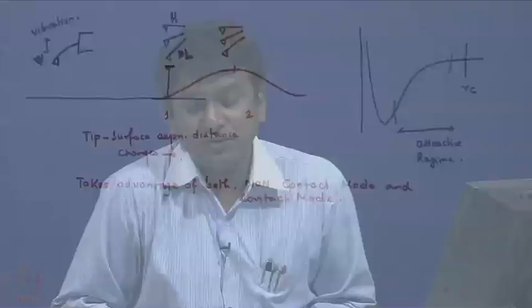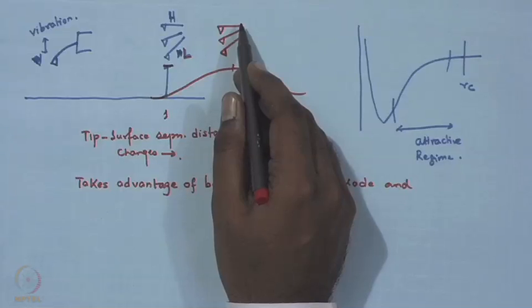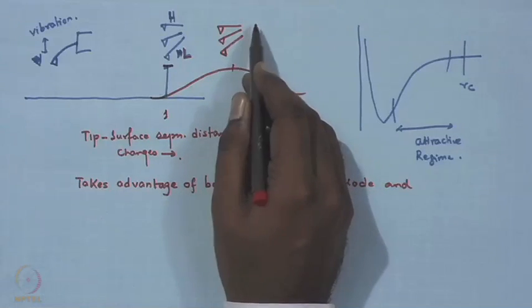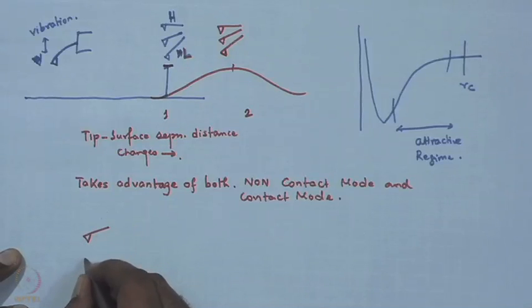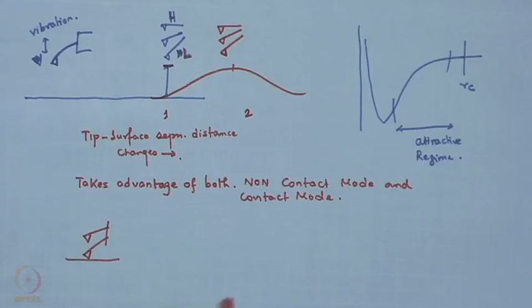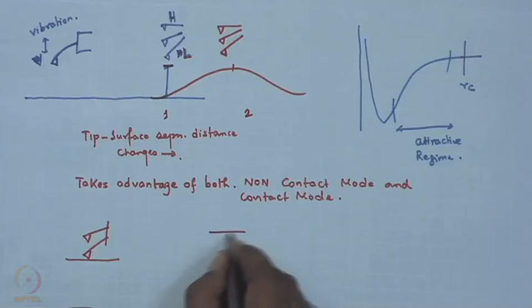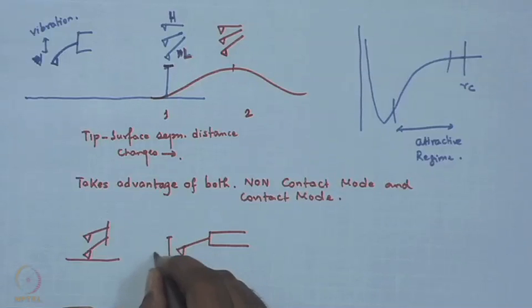You apply this additional amplitude or vibration to the sample tip, but instead of maintaining the oscillation entirely in air, you bring it closer enough, so that as a part of this oscillation, at one of the ends it touches or taps the surface. Okay. So, it is grossly the same concept that you give an amplitude. What happens is you now give a free amplitude. So, after you align, you give a free amplitude, let us say that the limit is L.